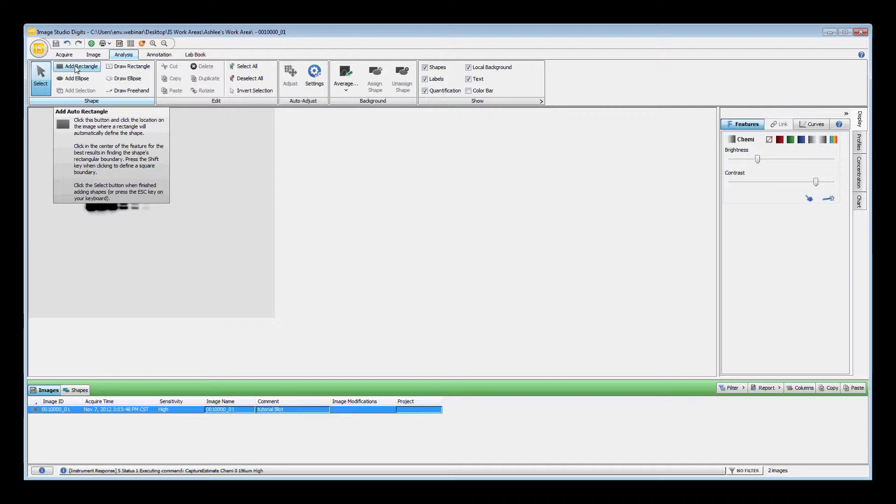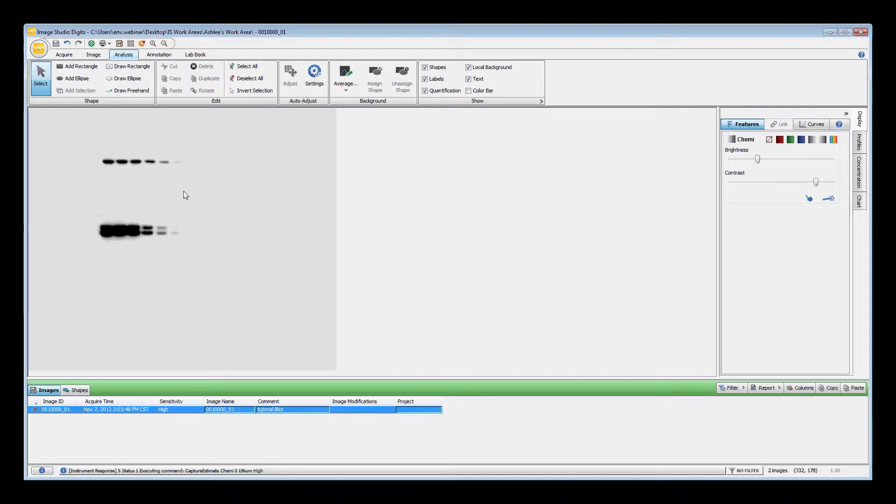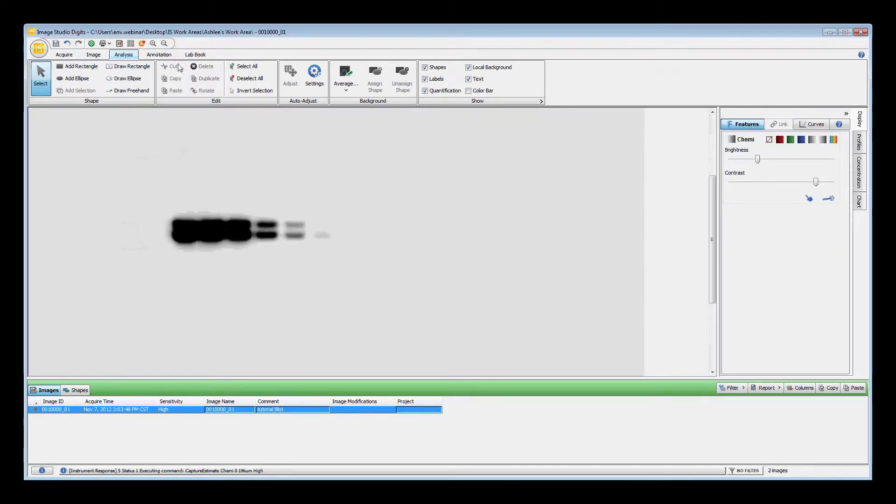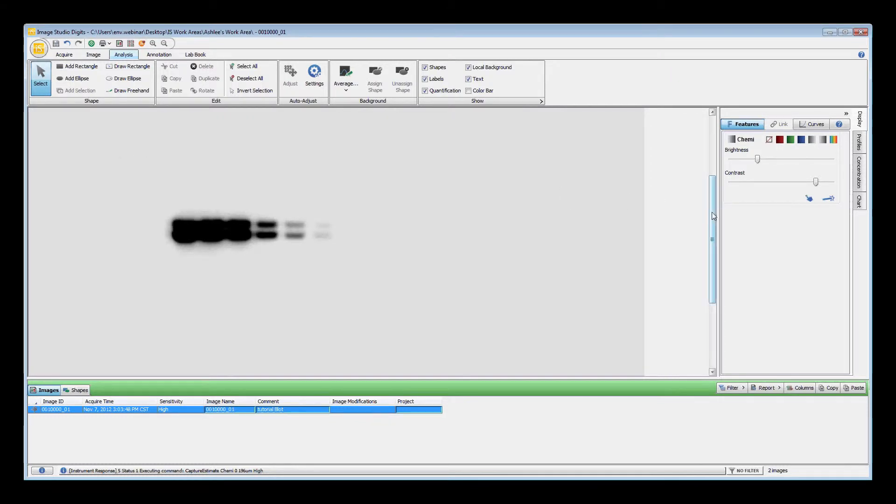Before you add features to your image, it may be to your advantage to zoom in. You can do that one of two ways. One, by using the scroll wheel on your mouse. Or two, by clicking the magnifying glass in the software toolbar.